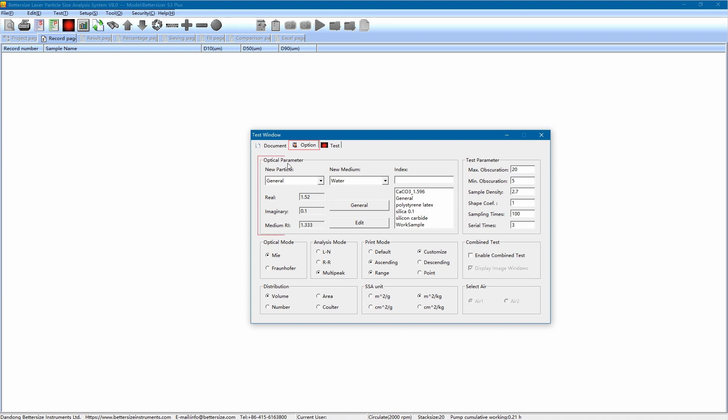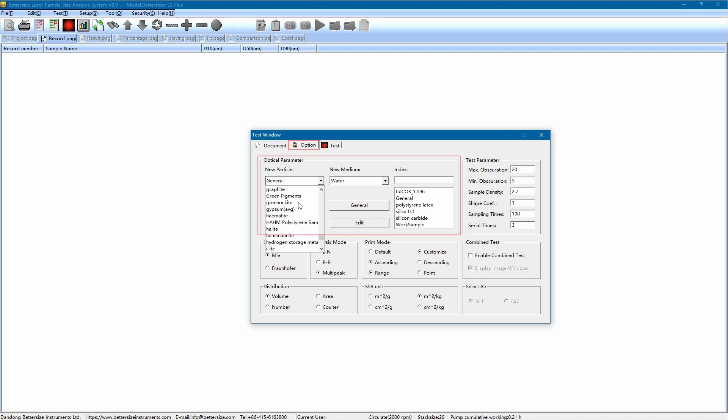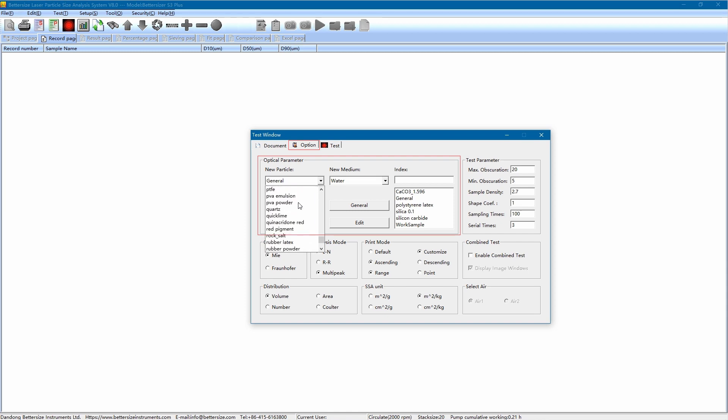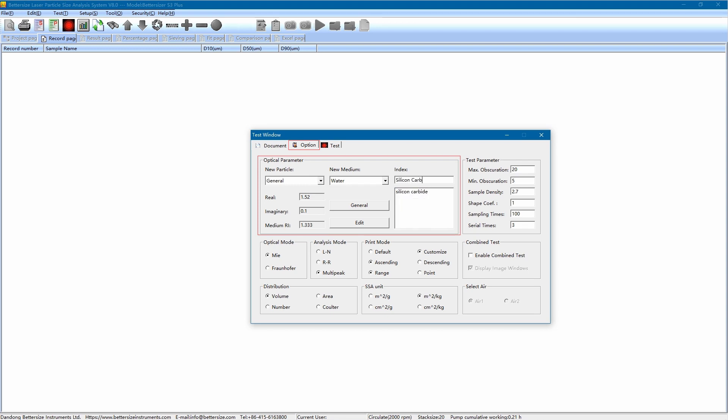Optical parameter refers to the refractive indices of the sample and medium. Every material has a refractive index, and it is an important parameter for the Mie scattering theory, so the selection or input of the refractive index is critical to the measurement results. The software already contains the optical parameters of more than 200 materials and 28 dispersion media. Here, we search for silicon carbide. Its refractive index appears. Let's double-click to select it.